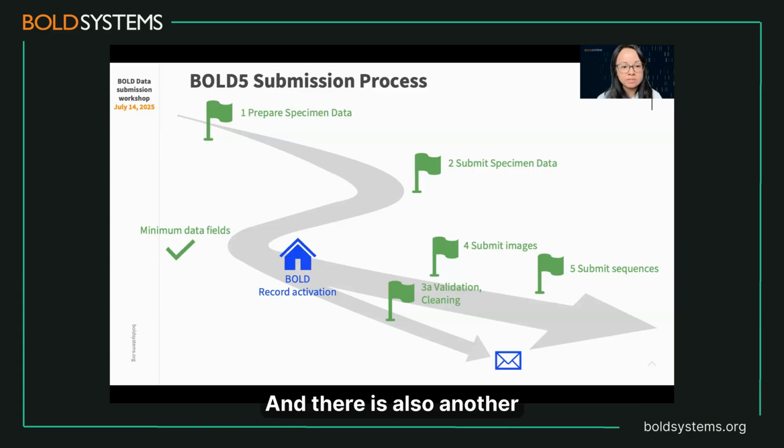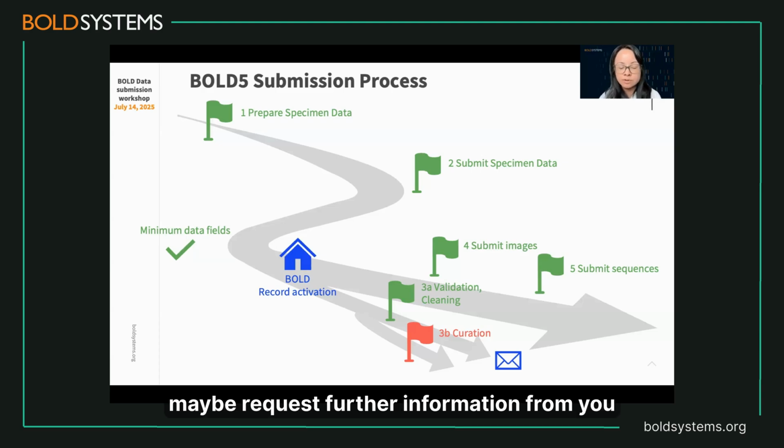There is also another off ramp where, if it is required, you will work with the curators, who may request further information from you just to make sure that the final bits of information in your submission are perfect. But I do want to stress that at this point, where it says BOLD record activation, your data is on BOLD.